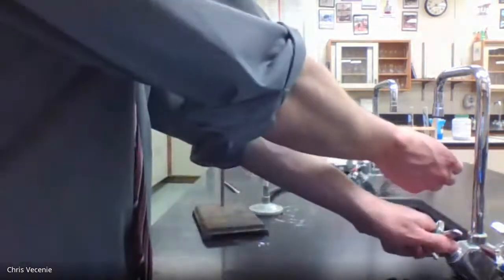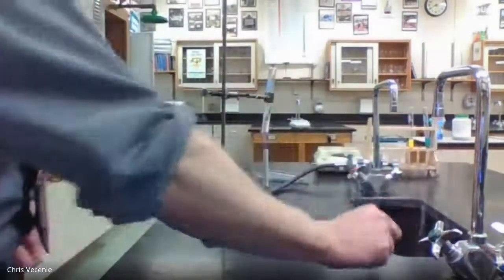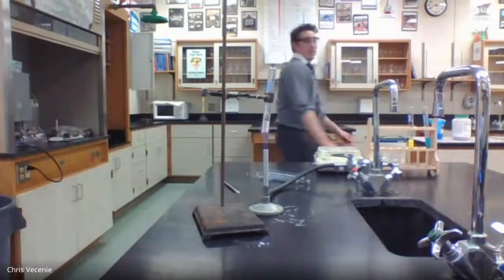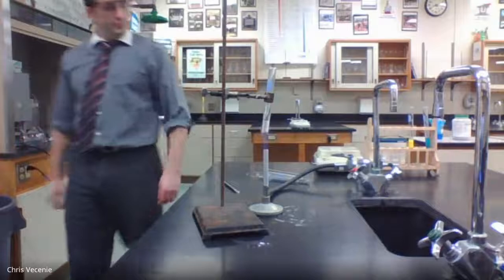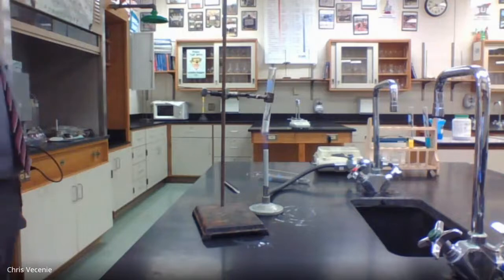All right, so in the meantime, I'm going to run some water on this. Okay, then I'm going to throw it in the trash can. And it looks like we've got about another 2 minutes to go.